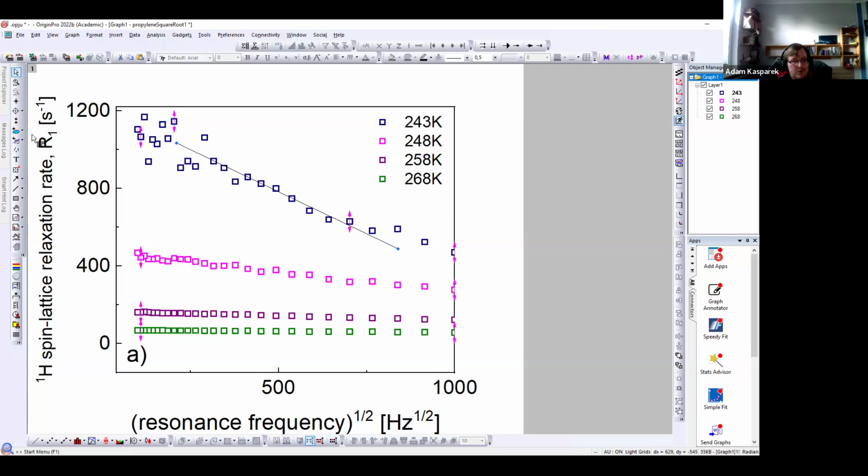However, if it goes up like here, we can clearly see that if we go over this 1000 on this scale, it's not linear any longer.